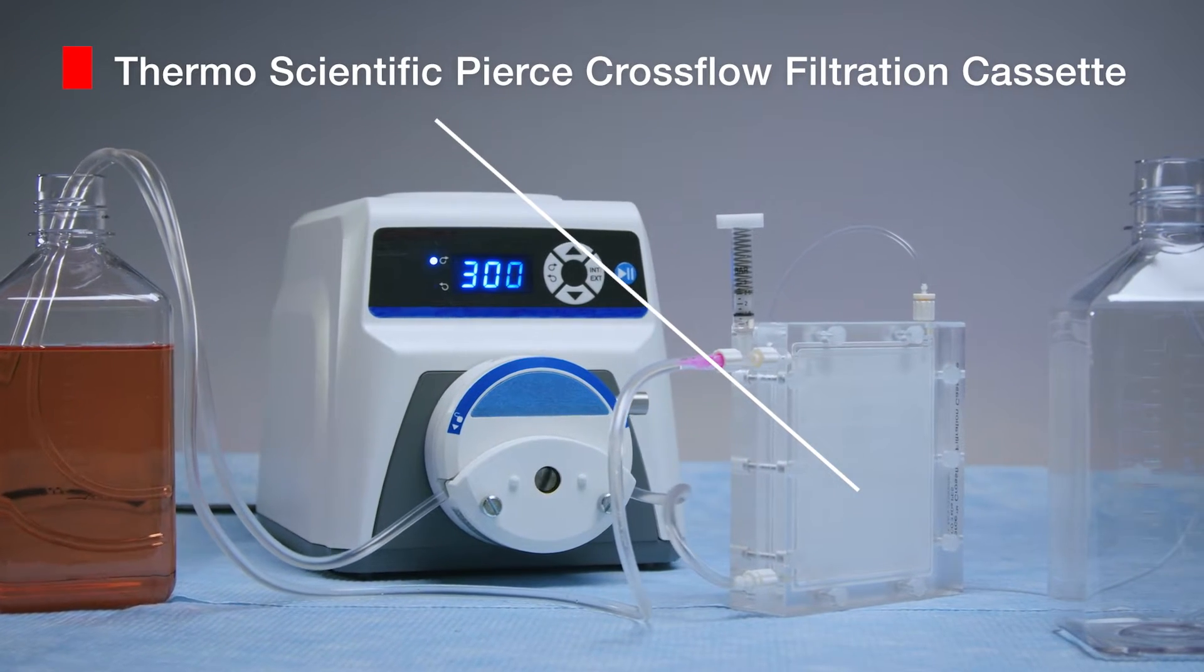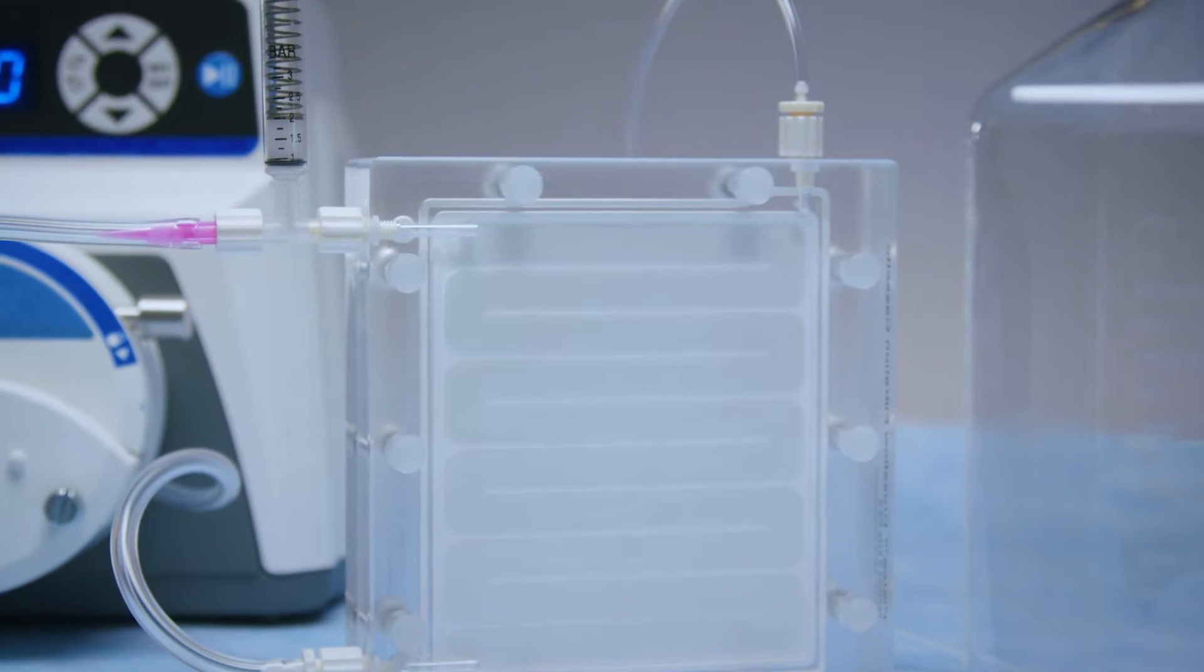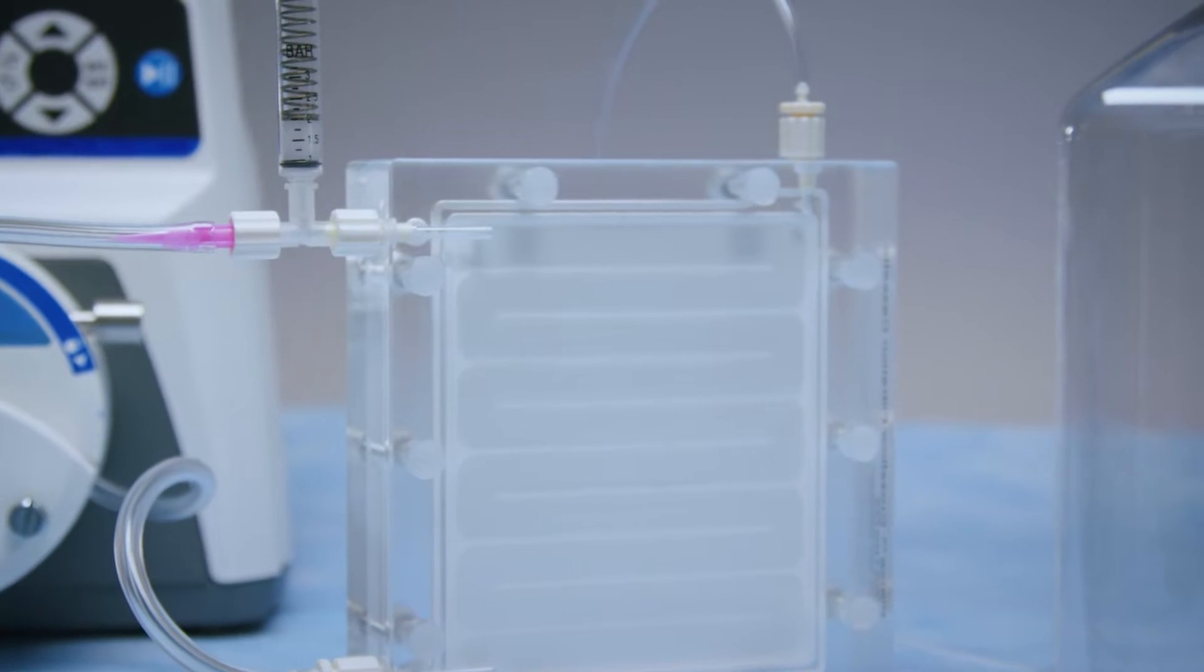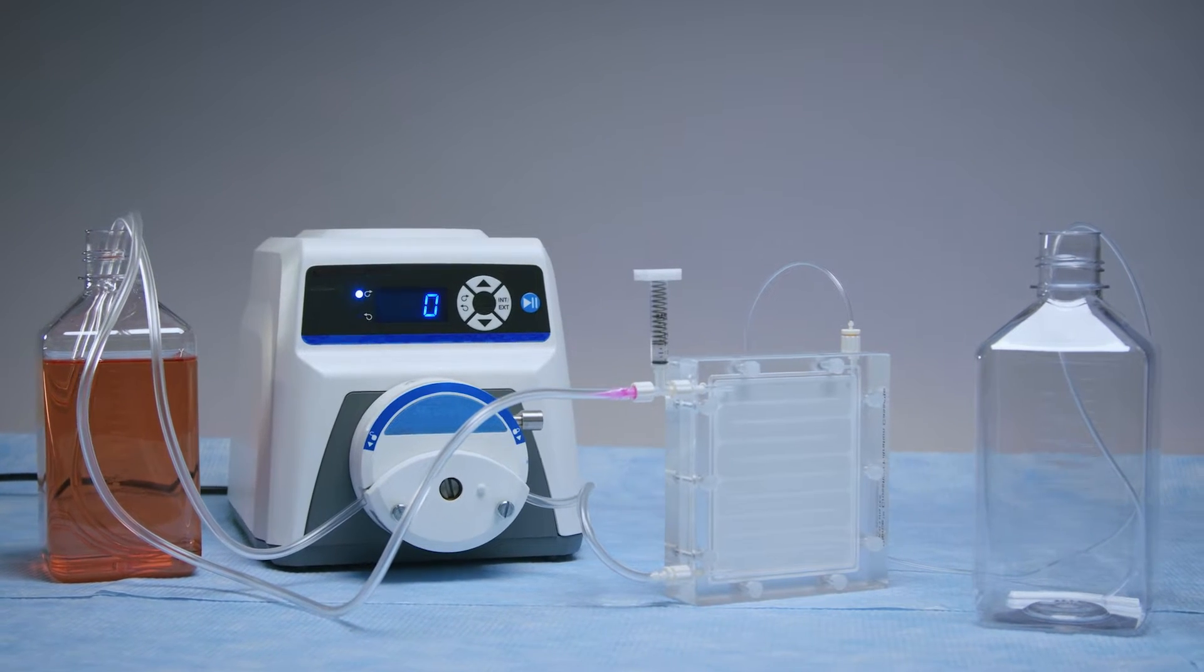The Pierce Crossflow Filtration Cassette is an easy-to-use, tangential flow filtration cassette for concentration and buffer exchange of biological samples such as proteins, nucleic acids, and virus particles.